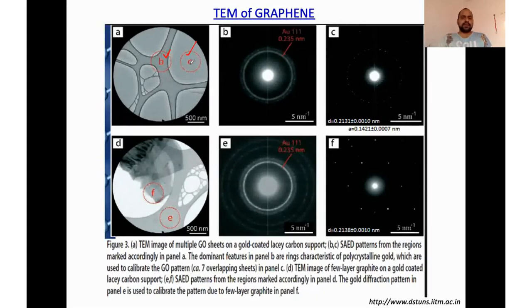of the gold pattern. And in case of C, again there are a lot of points, 1, 2, 3, 4, 5, 6, 7, then 1, 2, 3, 4, 5, 6, 7, 8. It's a little bit difficult to understand unless we have multiple data sets, but it indicates there is not a single layer because it's not a single crystal. There are multiple layers with a layer-by-layer structure.